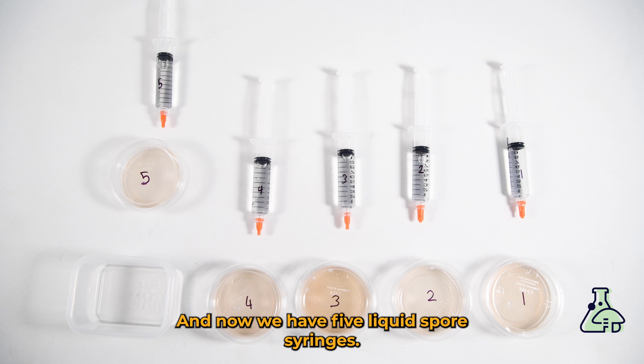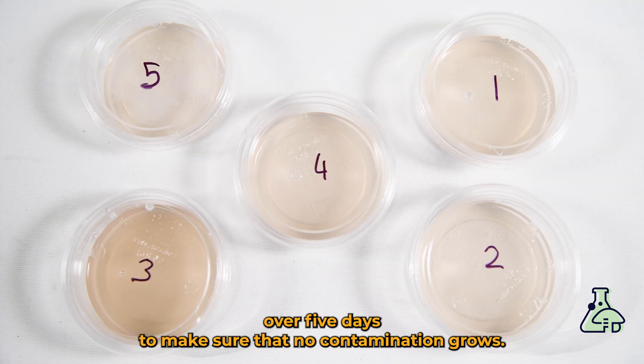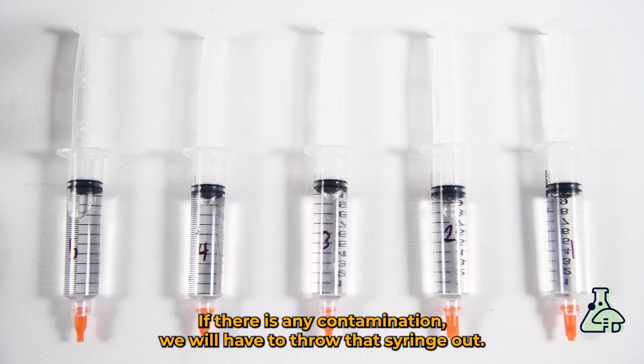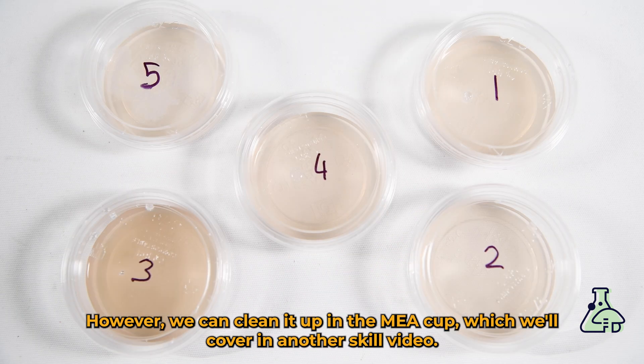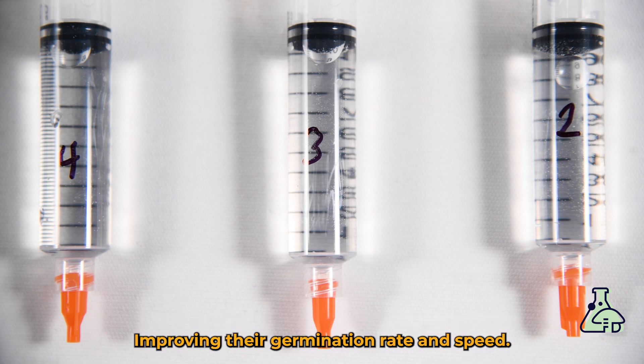Now we have five liquid spore syringes. We want to monitor them over five days to make sure that no contamination grows, keeping in mind that most contamination starts off white before changing color. If there is any contamination we will have to throw that syringe out, however we can clean it up in the MEA cup, which we'll cover in another skill video. Leaving the spores for over 48 hours also gives us a chance to rehydrate spores that are over five years old, improving their germination rate and speed.